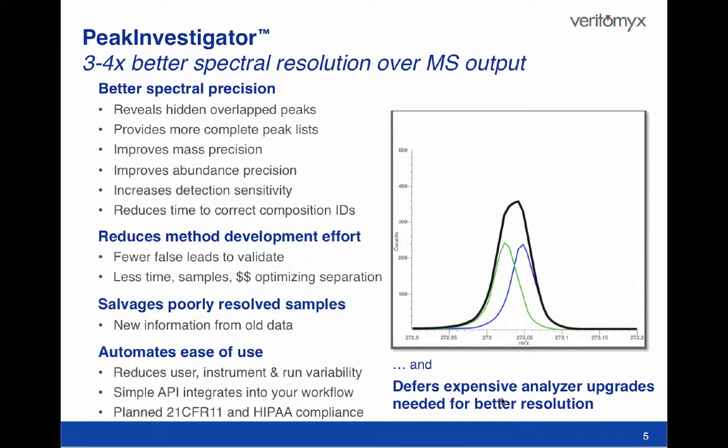Multiplying the effective resolution of your existing mass analyzers also helps defer the timing of your next big mass spec investment in pursuit of better resolution. Let's dive into a specific example.